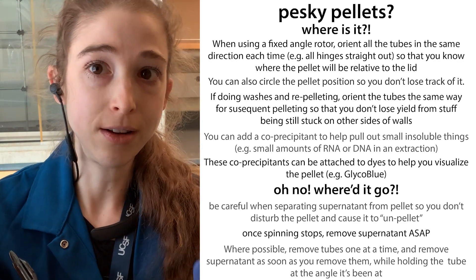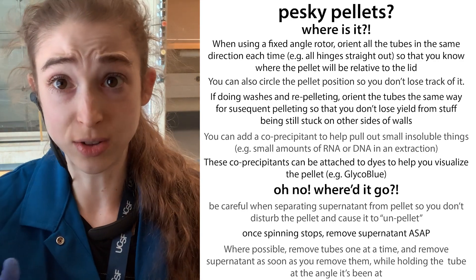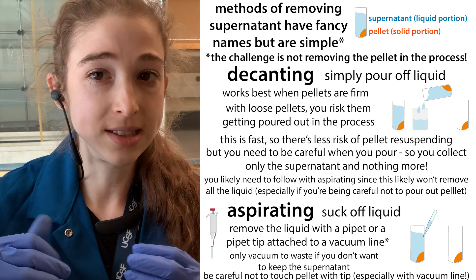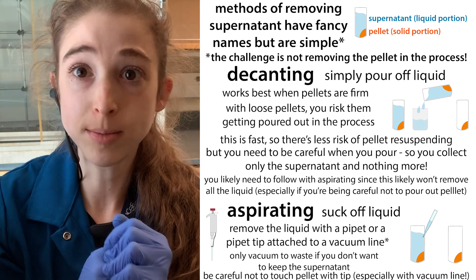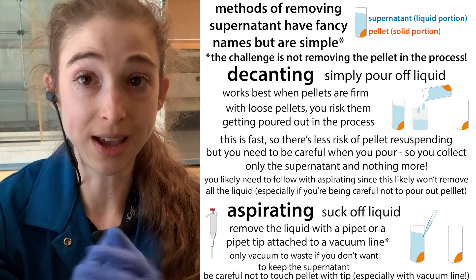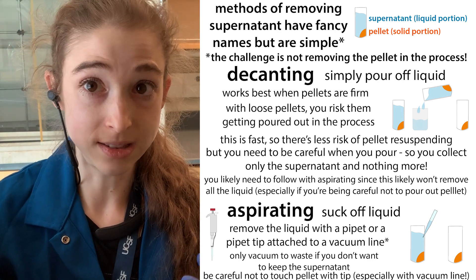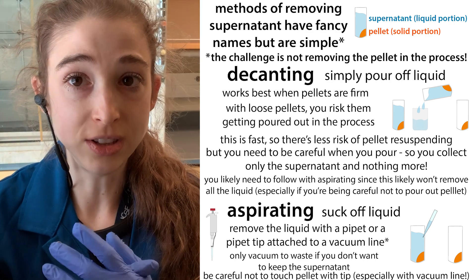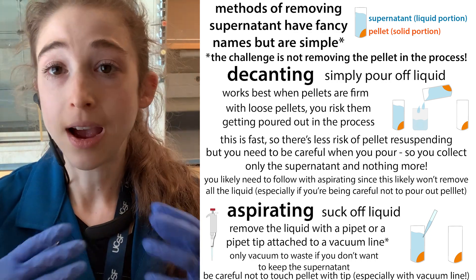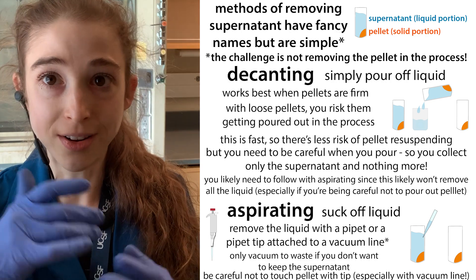Now your job is to get the liquid off the pellet without disrupting it, because if you don't, they're going to mix back together. Some pellets are really tight and firm and easier to work with; others are loosey-goosey and it's hard to remove the supernatant without disrupting the pellet. First identify where the pellet is, then get the liquid away from it without disrupting it.